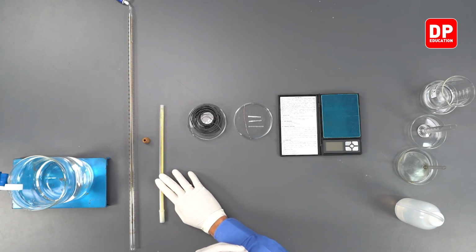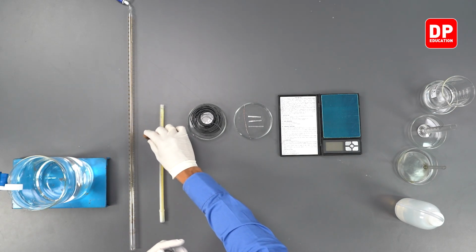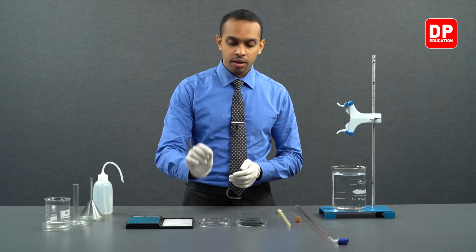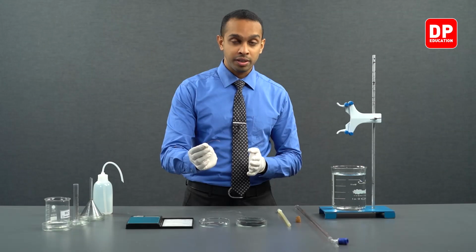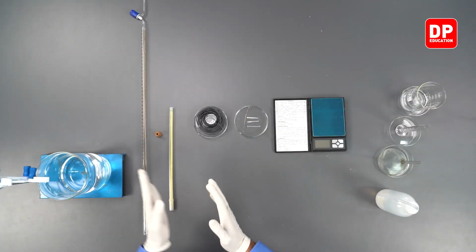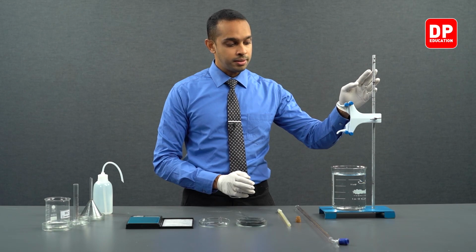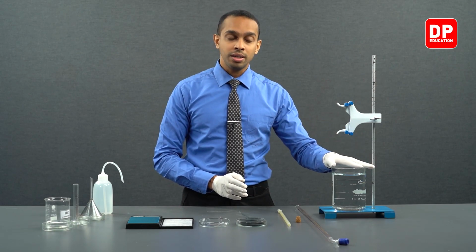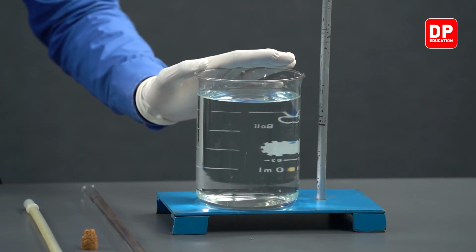We'll be using a thermometer, a cork to hold the magnesium strip in place, a copper wire to tie the magnesium strip and connect to our cork. We'll be using a burette, a retort stand, and we'll be using a 1 liter beaker filled with distilled water.